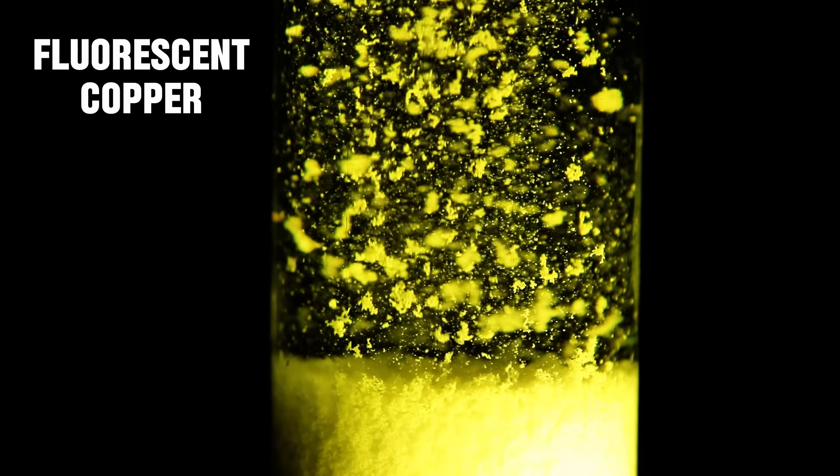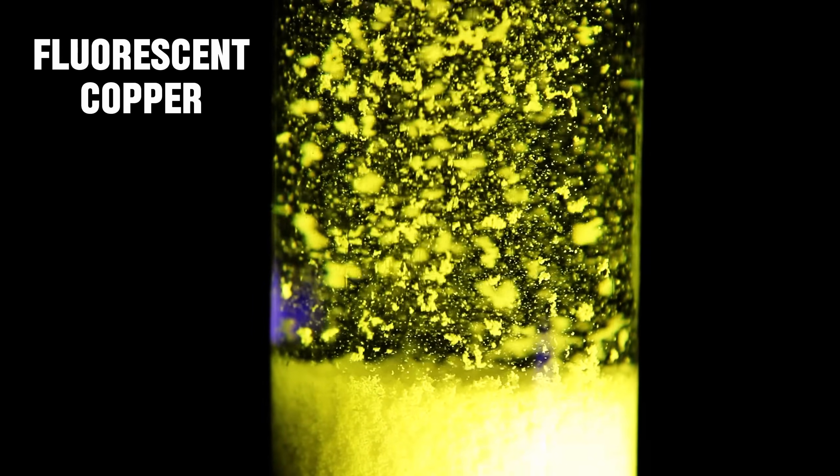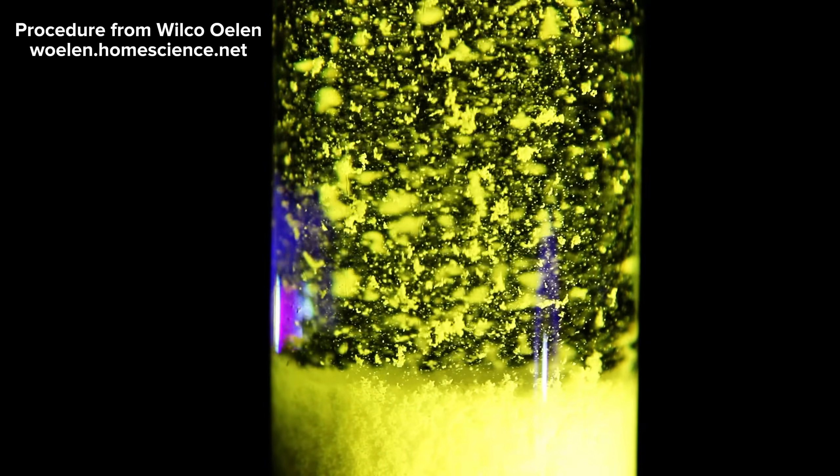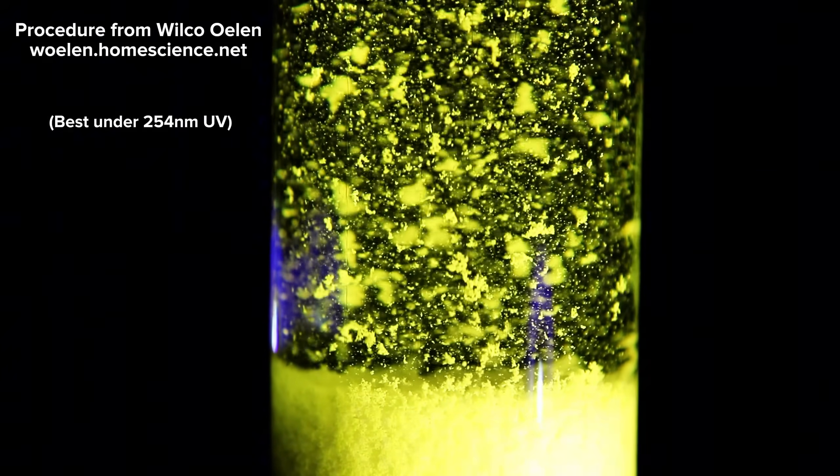Today I'm going to make a beautiful fluorescent compound from some scrap copper that I had intended to throw away. This particular compound glows very brightly under UV light and comes in two distinct colors depending on how you make it.